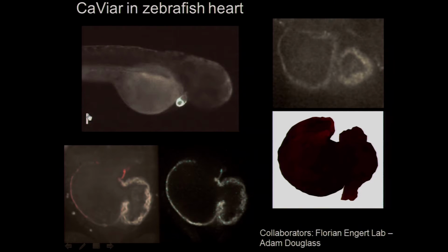We've developed a custom spinning disk confocal microscope for doing optical sections inside of the live animal. So here's a video of the electrical signal in the heart of this fish. This is taken inside of a live fish. Fish have a two-chambered heart, so here's the atrium and here's the ventricle, and you can see the electrical signal propagating through the fish.